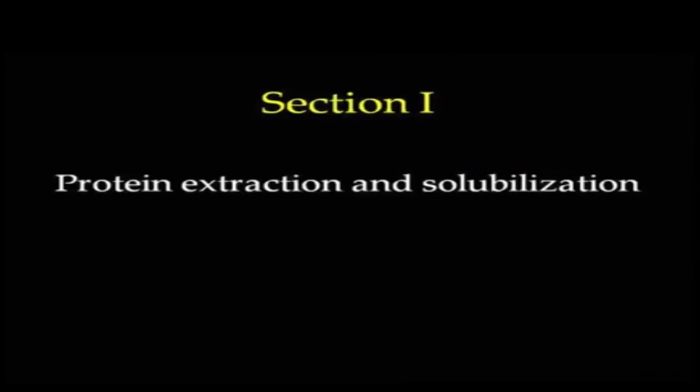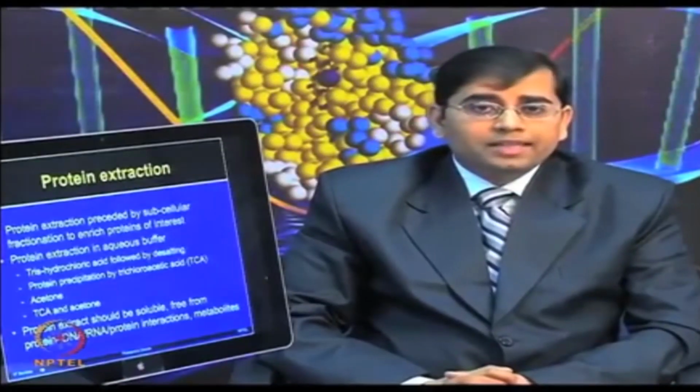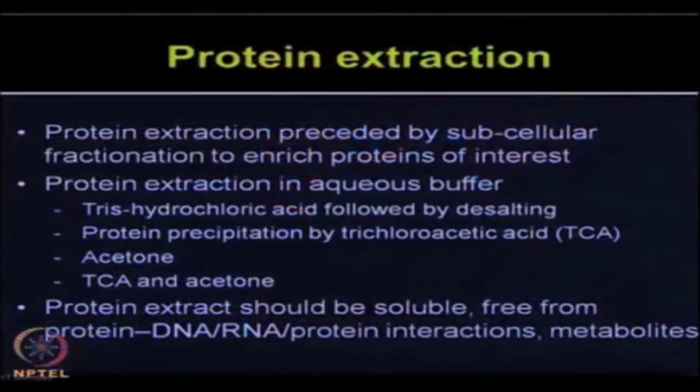So, protein extraction, after performing the subcellular fractionation so that the proteins you are going to analyze in your experiment can be enriched. For protein extraction in the aqueous buffer, one can follow different types of procedures: either use Tris hydrochloric acid followed by the desalting method, protein precipitation by trichloroacetic acid or TCA, or acetone alone, or trichloroacetic acid and acetone.